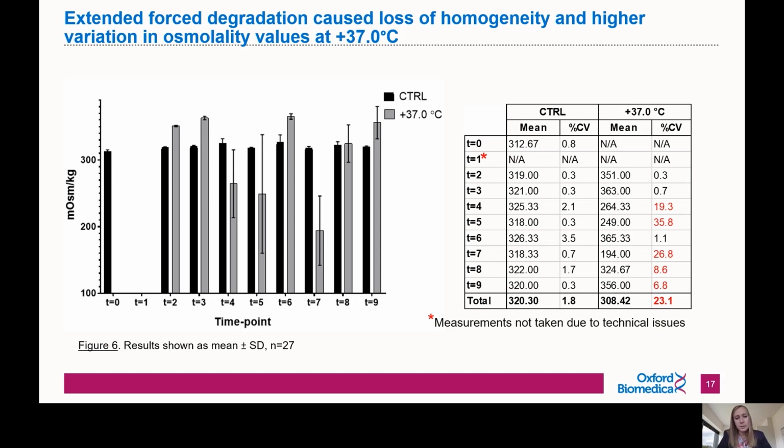This is probably a little bit different from previous results. This time, the overall mean values for osmolality were lower rather than higher or similar to control. This is not necessarily negative or positive.